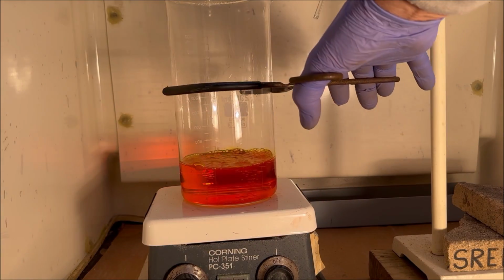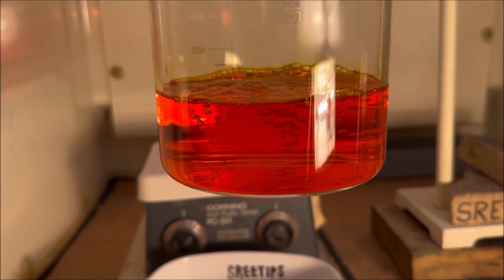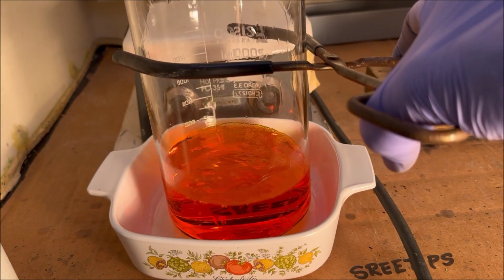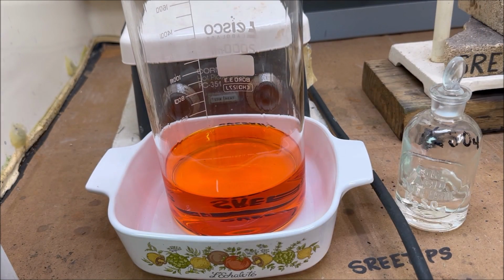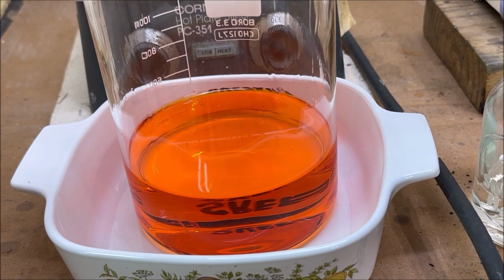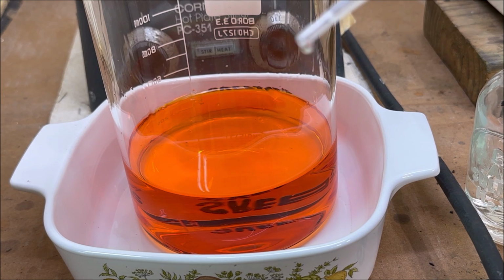Now we'll pull our gold solution down. Look at how clear and pretty that looks, man. That's just beautiful chloroauric acid solution. We'll pull it down, let it cool off. Before I forget, let's put some sulfuric acid in here and watch it closely to see what happens. See if we get any lead precipitating out of here. I'm just going to put just a little bit in there.